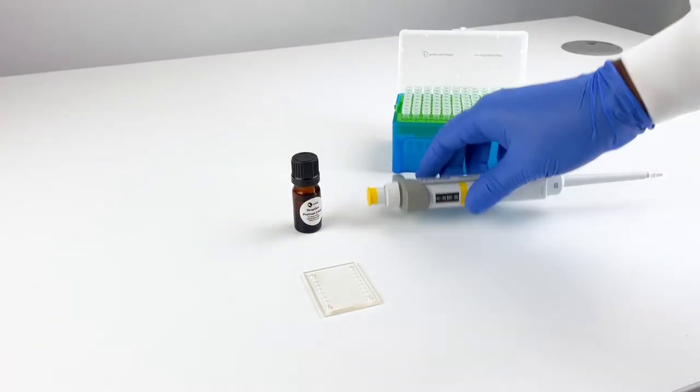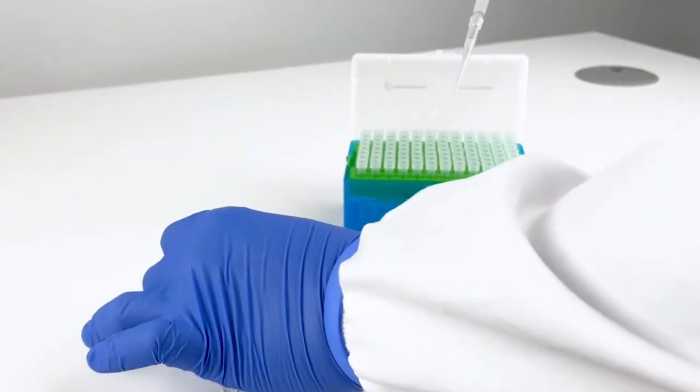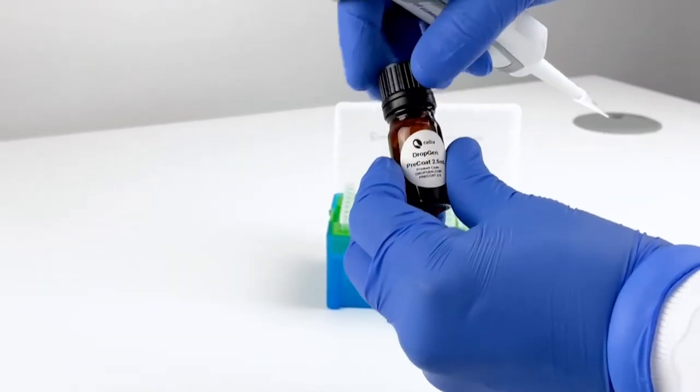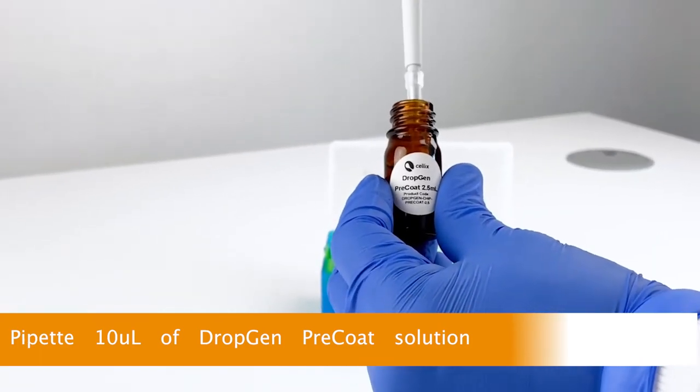How to pre-coat the drop chip? For droplet generation experiments there is no need to pre-coat the flow splitter, only the droplet generator. In this example we pre-coat the first droplet generator.